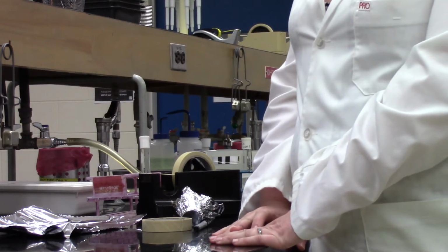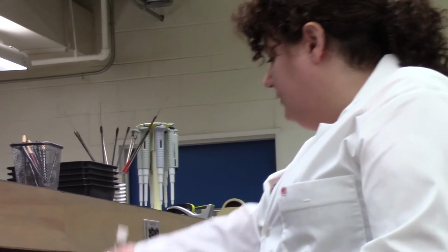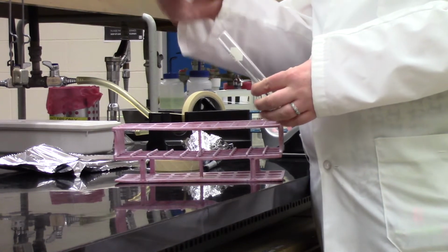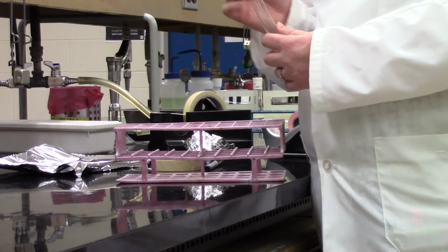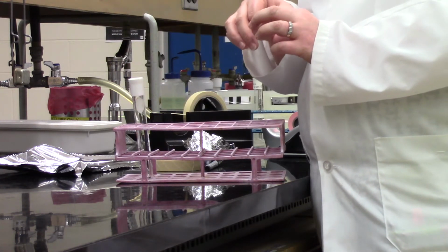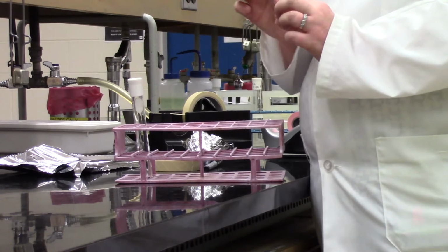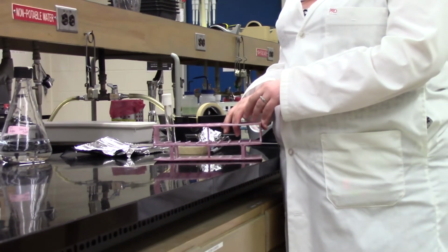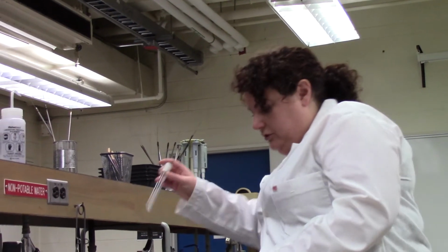Now, media in a flask is just one type of material that you might want to autoclave. Another option can be liquid in test tubes. So for these, you just want to make sure that your test tube has a cap on it and that you've pushed that down. These caps are already vented, these ones that just push on. But some of the test tubes do have screw tops, and if you're using one of those, just use the same rule that we use with the flask. Make sure that it's loose enough that air can escape, but tight enough that the lid isn't going to blow off.